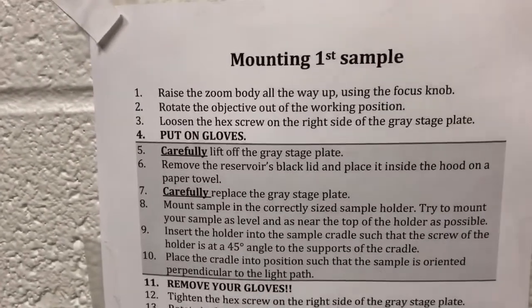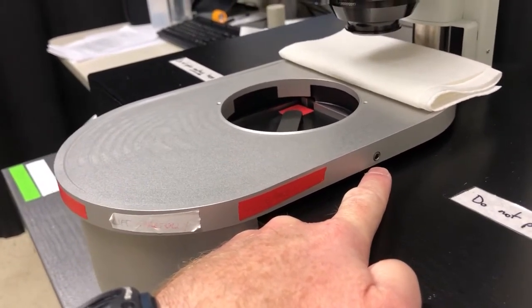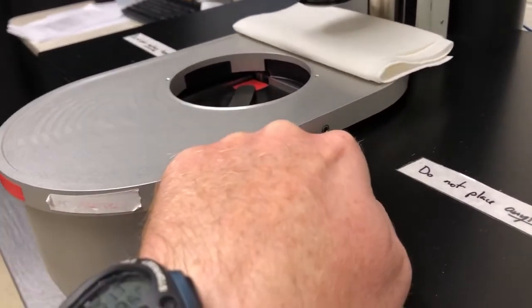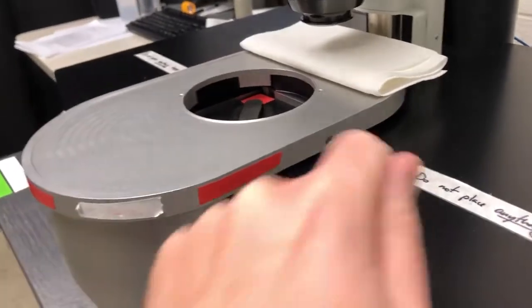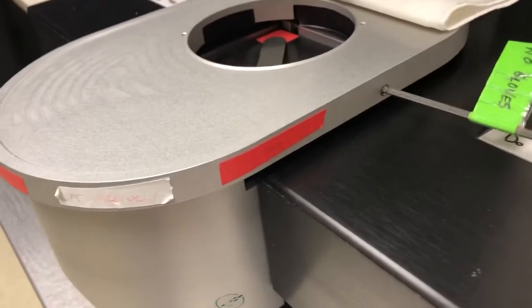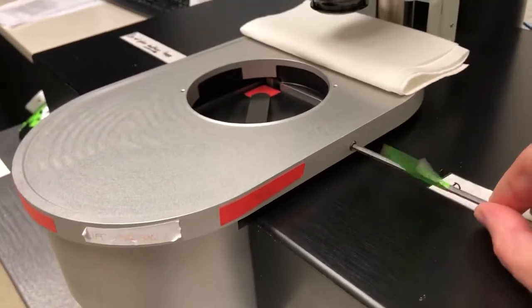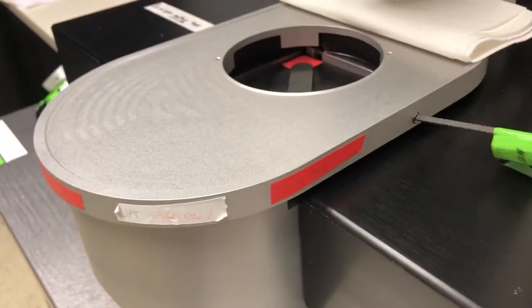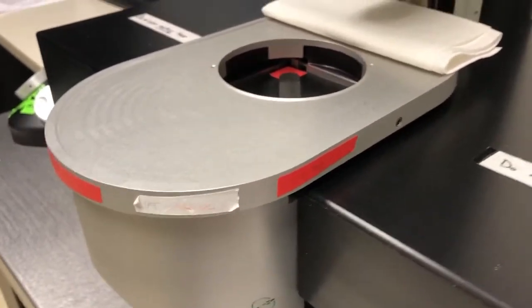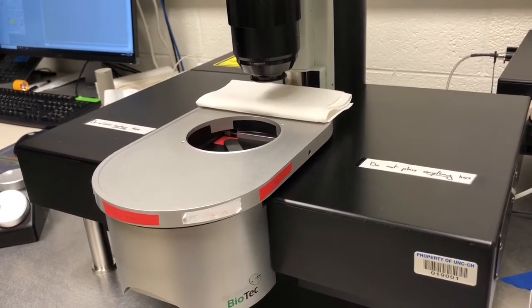Step three is to loosen the hex screw on the right side of the gray stage plate. That should be left loose, but we check it because not everyone remembers. We need it loose because we'll need to remove the stage plate, and if it's tight we won't be able to. We use this hex key — insert it and check whether it rotates freely. If it does, it's loose; if it feels firm, it's tight. Just loosen it — don't remove it, because it's a very small set screw that would be very difficult to find if dropped.